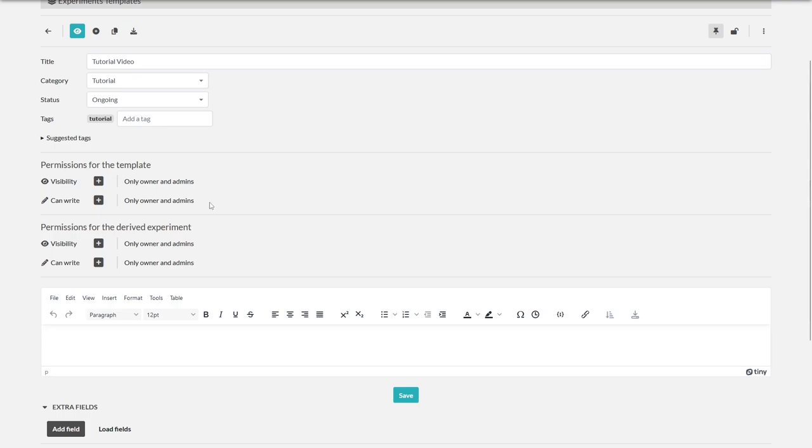And you can set the permissions for the derived experiment, which can of course be changed in the created experiments.